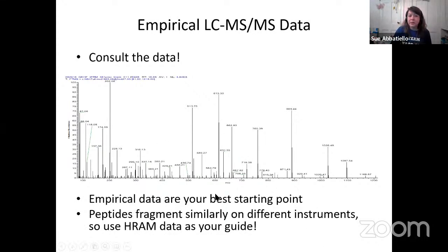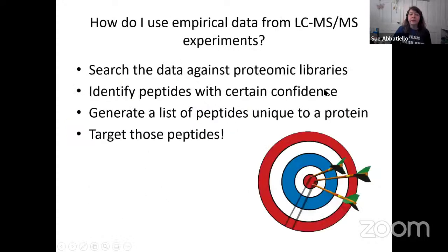So, and this is just based on if you're using the same type of fragmentation mechanism, meaning collision induced or collisionally activated dissociation, you should see a lot of the same fragments, perhaps not at the same ratios, but you can be pretty confident that they will be generated similarly.